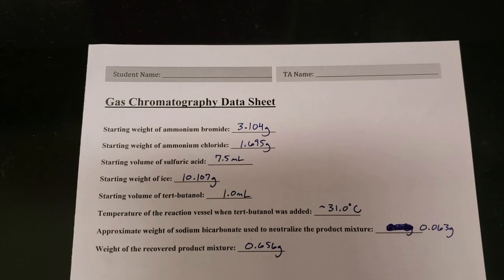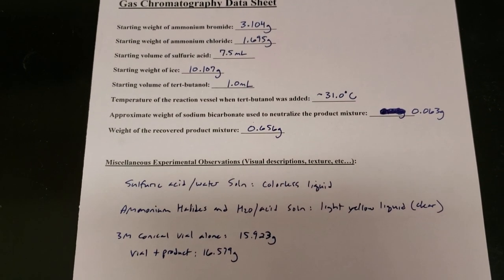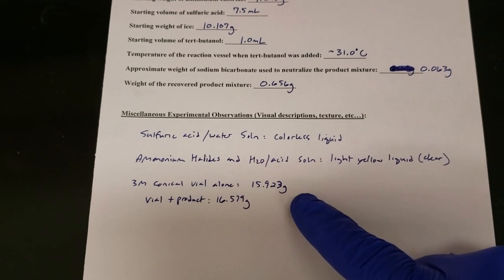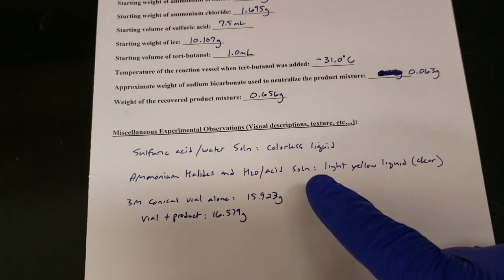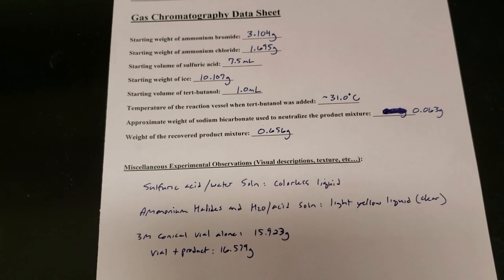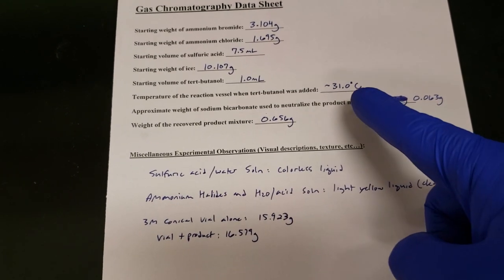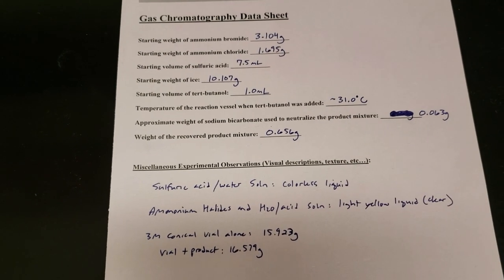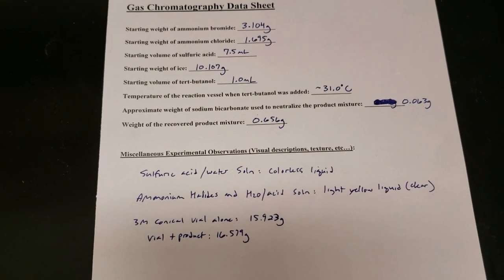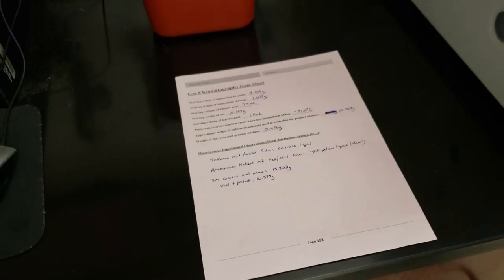Okay, so this is a data sheet update on everything that we've done so far. We have the weight of our final product in our vial. We have the weight of our vial alone. So that gives us a total of 0.65 grams of our final product mixture. We've recorded our sodium bicarb amounts. We've recorded the temperature at which we started the addition of our alcohol, our T-butanol. So everything is set and ready. Make note of all these values so that you can write them up on your lab report.